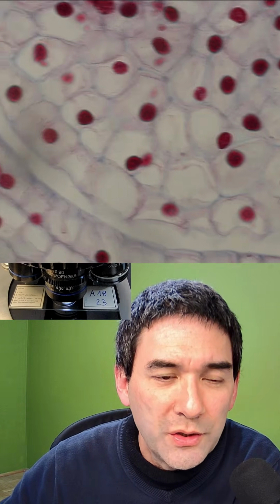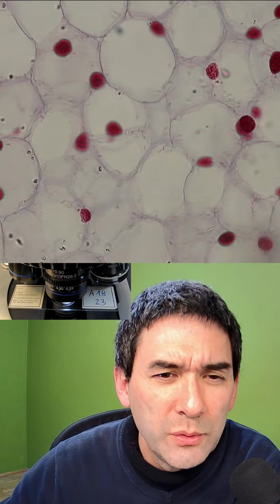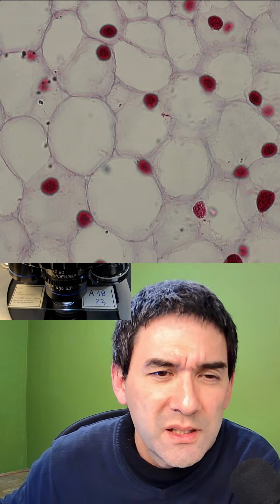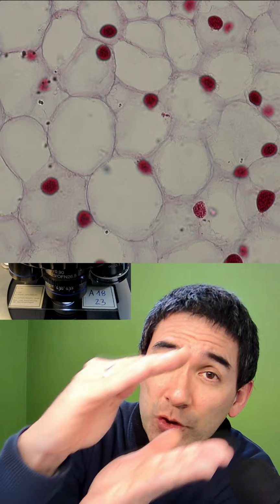Now, in case you wonder why some of the cells do not have a nucleus, like over here, for example, why do I not see a nucleus over here? Some cells seem to be empty, and the reason is, of course they have a nucleus, but you don't see it because when it was cut, it was sectioned, right?